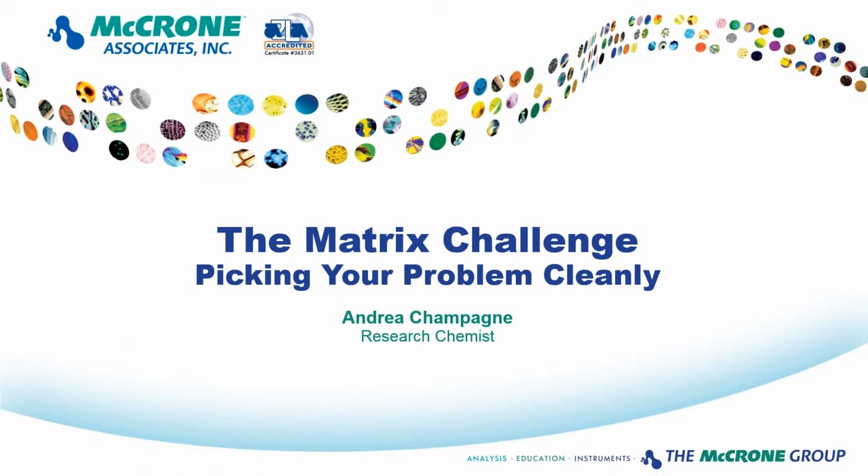Andrea is going to talk to us about good sample preparation and the challenges that different matrices present when trying to do particle isolation. The title of her talk is The Matrix Challenge, Picking Your Problem Cleanly.